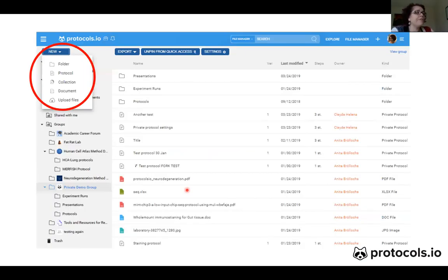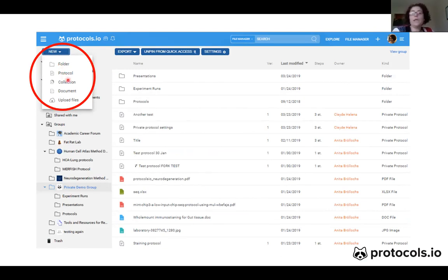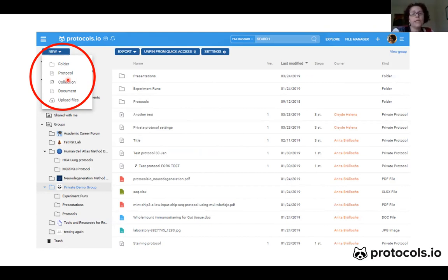Also in the file manager, once you are in your private group folder, you can create subfolders within the group. You can then add files that are pertinent to your group, and those files are visible to everybody who has joined the group.